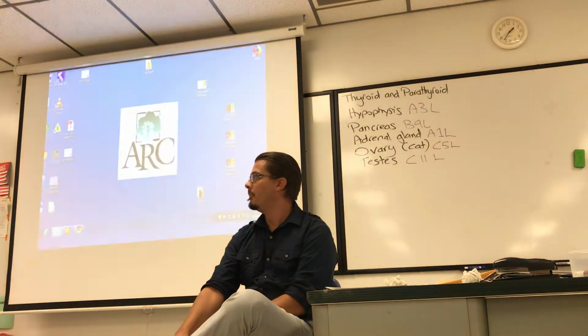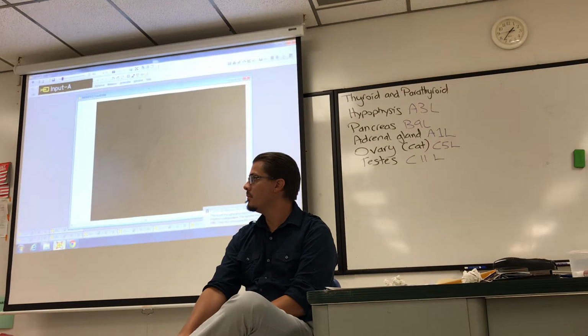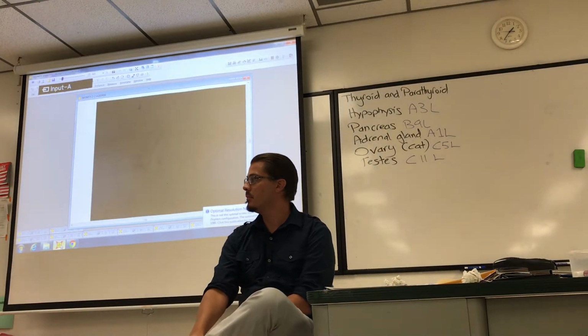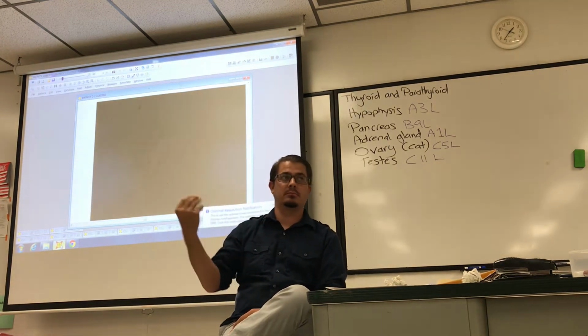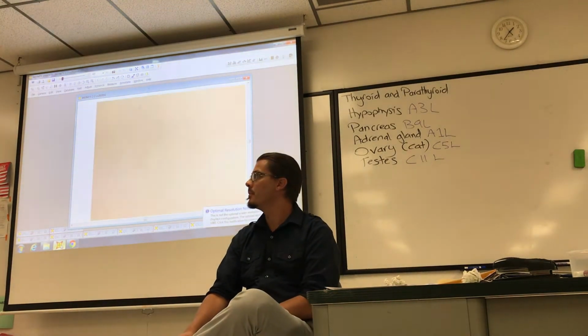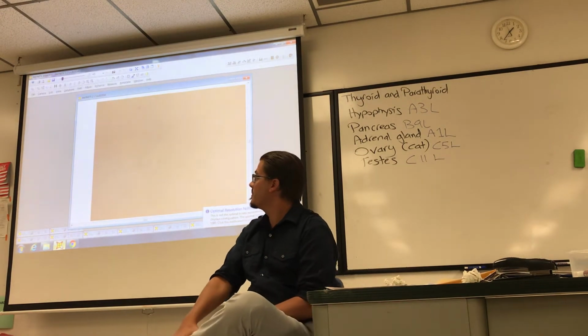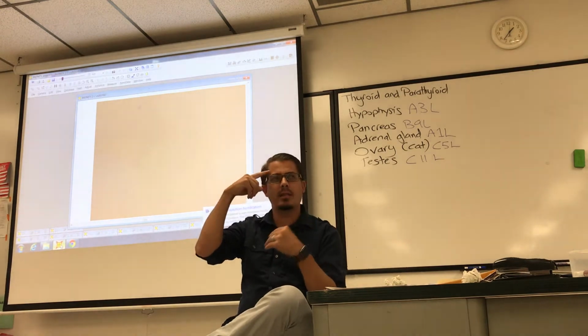Open her up. So what I see, you'll see there. Okay. And it helps if I turn this off. I might turn the lights on or off a couple of times.